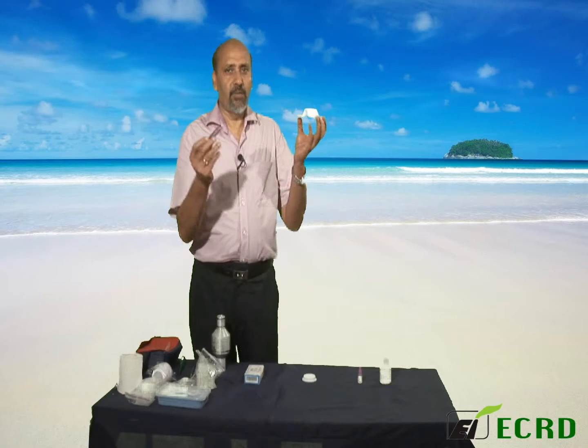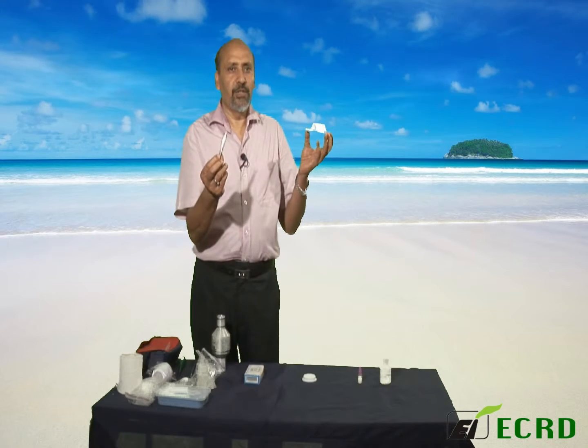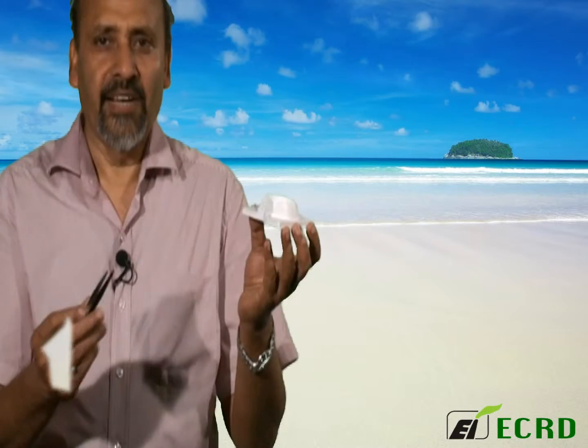Notice that I am holding a tweezer which will be used to handle this filter. Never touch it with your bare fingers because you will leave residues on the filter which will interfere with your measurement.